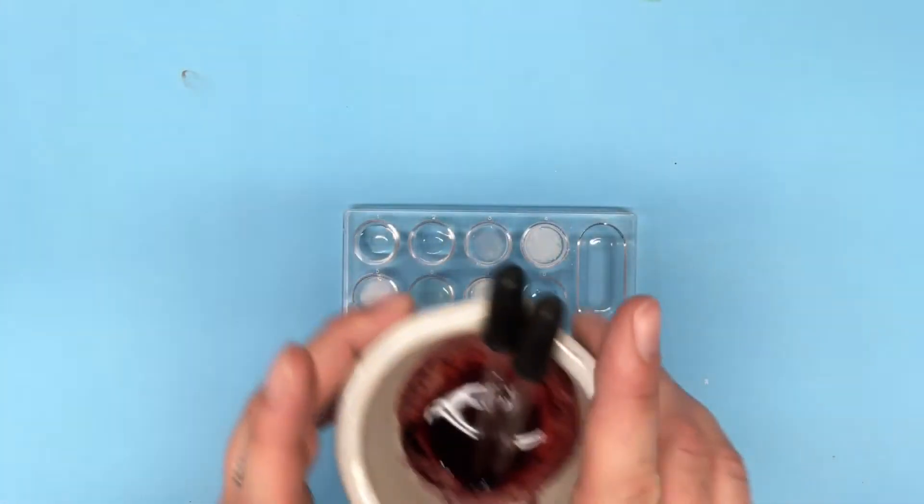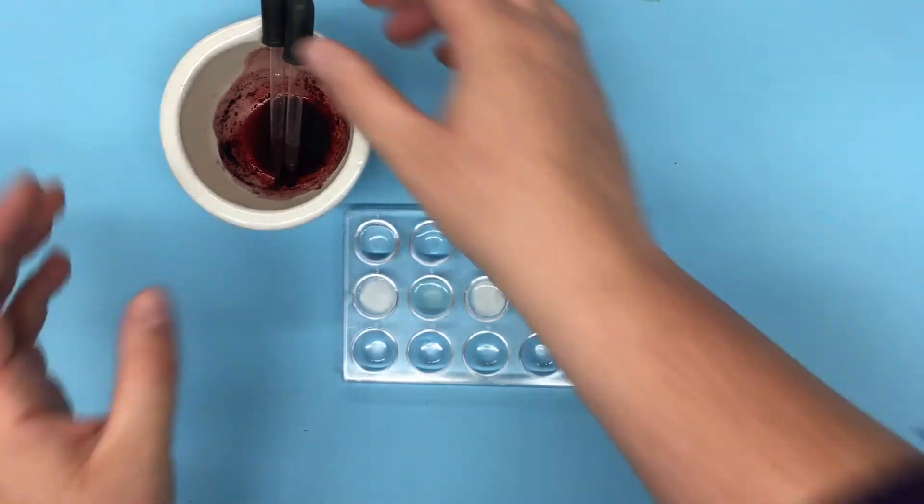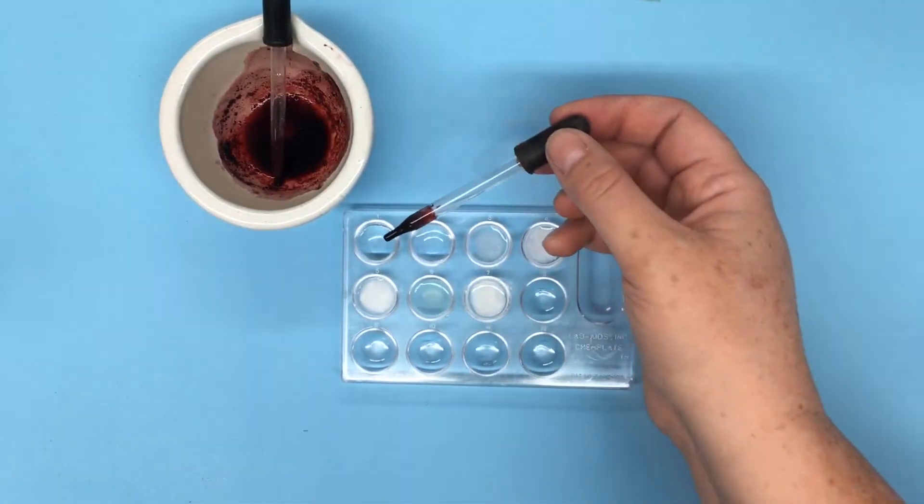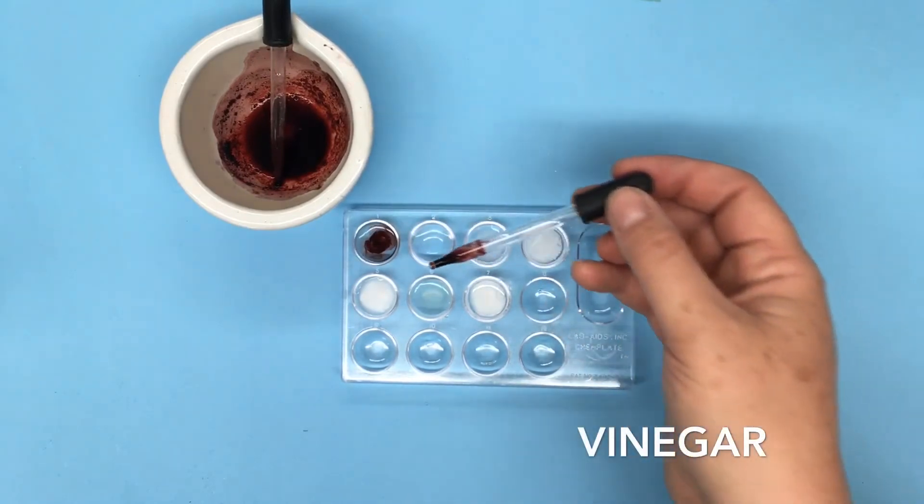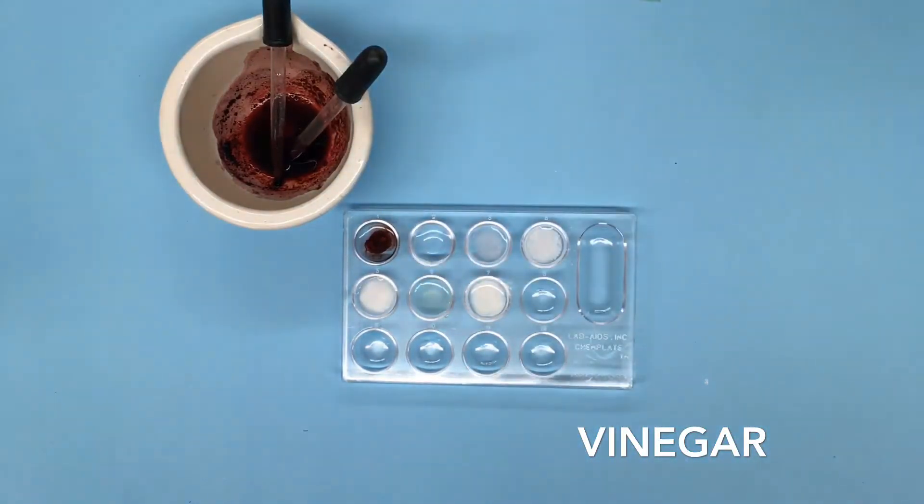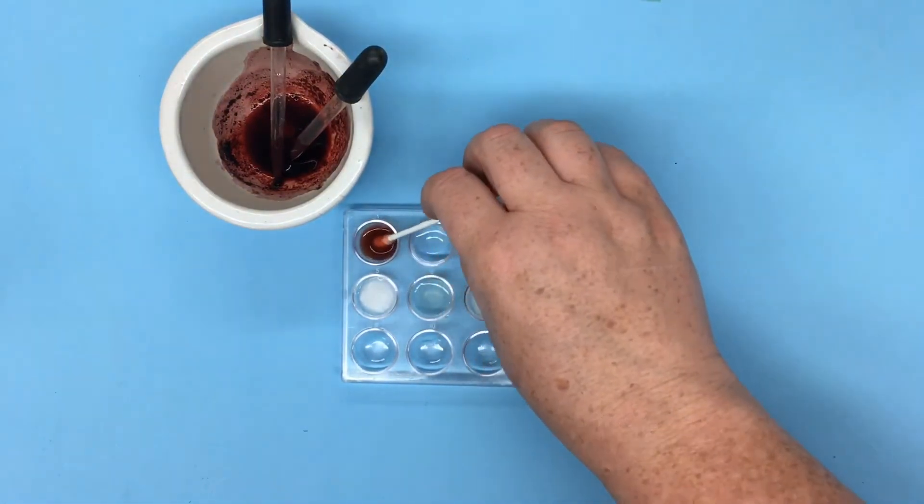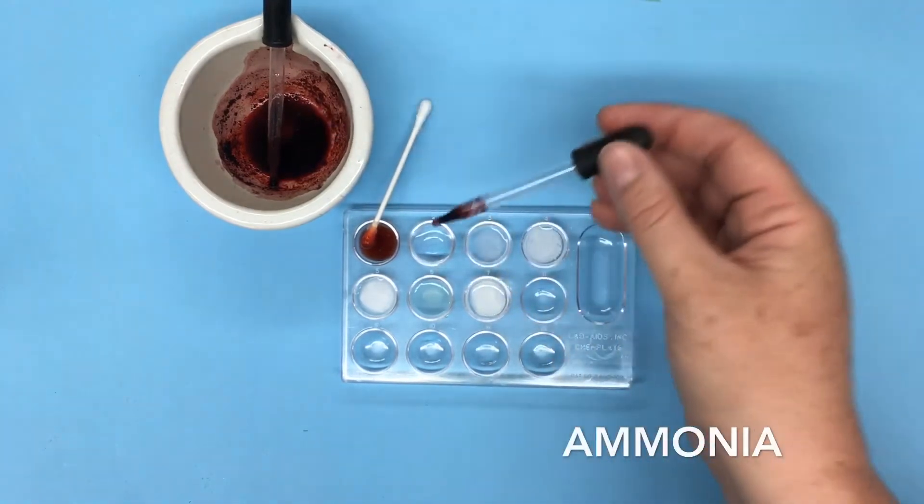So now let's bring our carminic acid back in. Remembering that it's a nice deep red color. First we'll put it into the vinegar and just give that a little bit of a stir. We can see a color change already. That one looks bright orange.